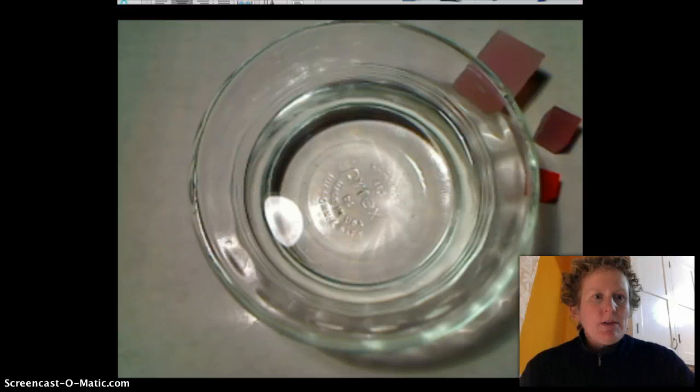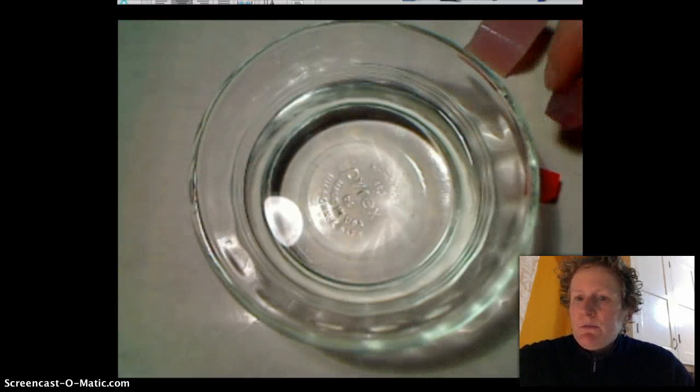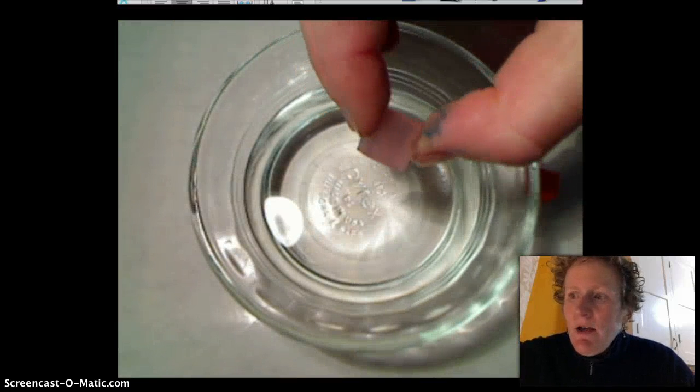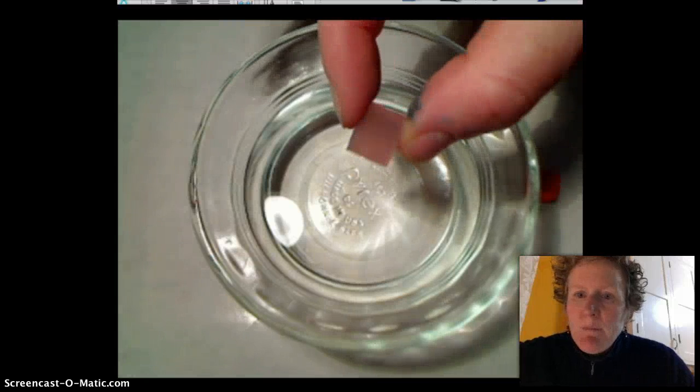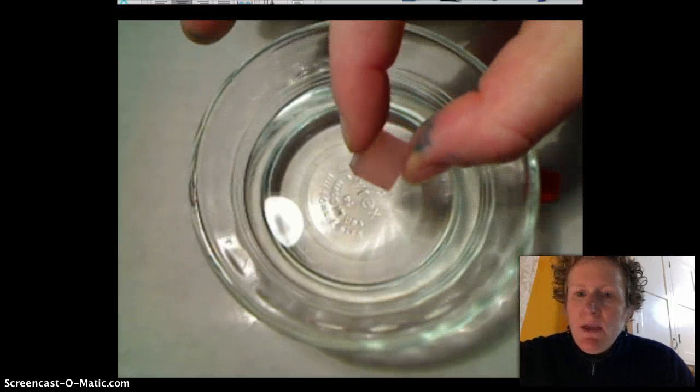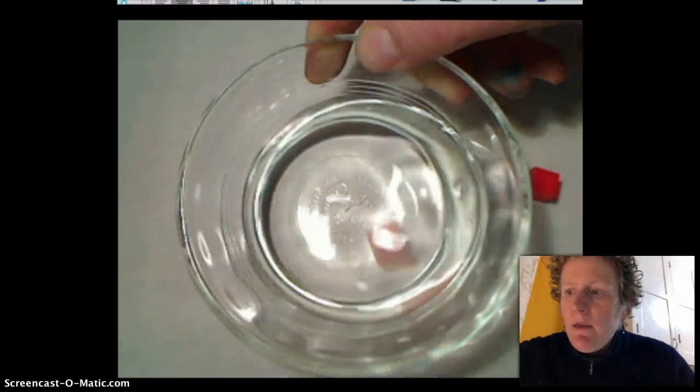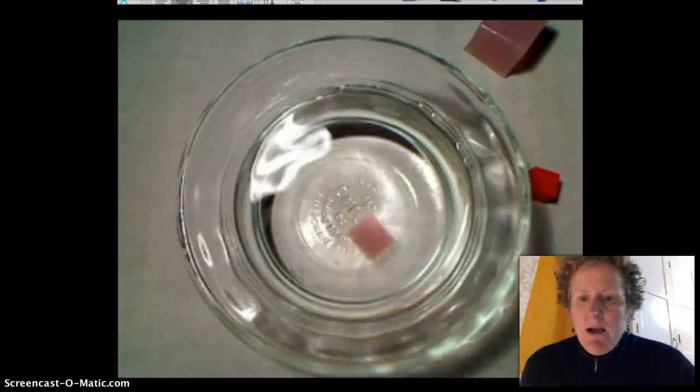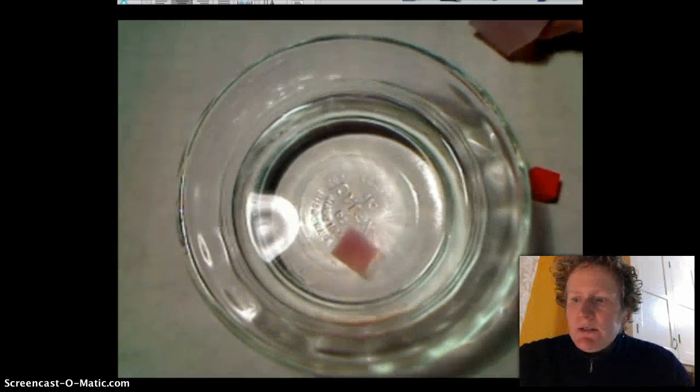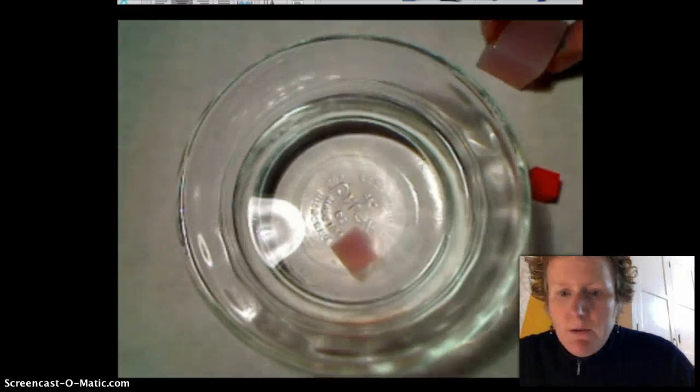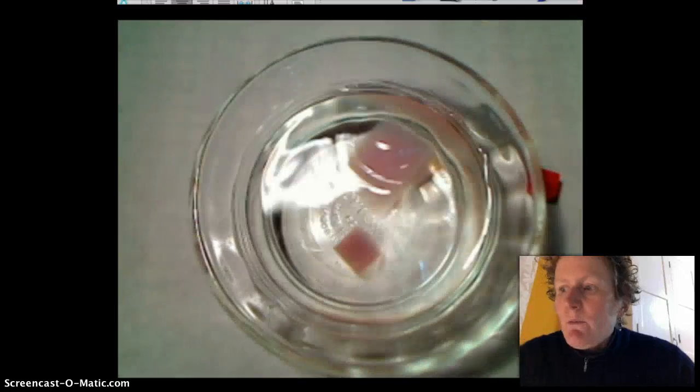The thing we're going to measure in millimeters is the rate of diffusion. We're going to tell how fast this vinegar diffuses into this block of agar by looking at the color. I'm going to drop that in there and you notice that block of agar, it's made from jello gelatin. The outside edges are going to start to turn a little bit white.